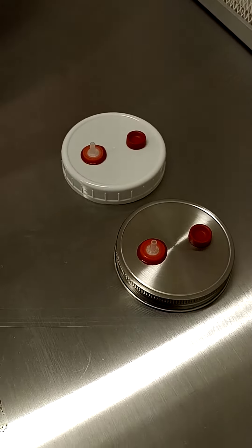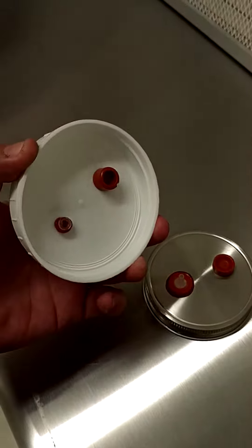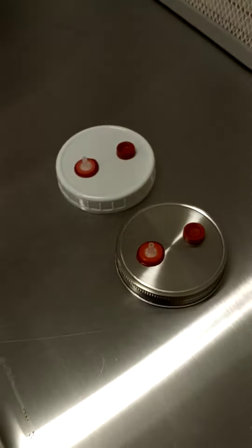They last pretty well in the sterilizer, probably for about 50 or 100 runs, and then the plastic starts getting kind of loose and they won't stay in the jars anymore.